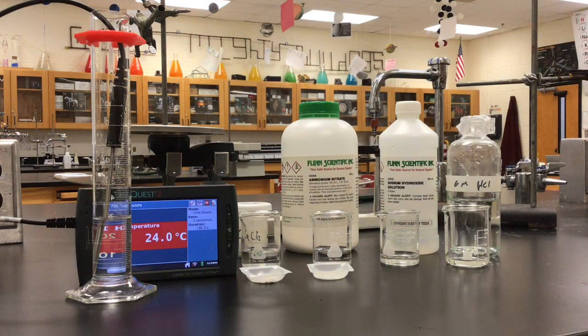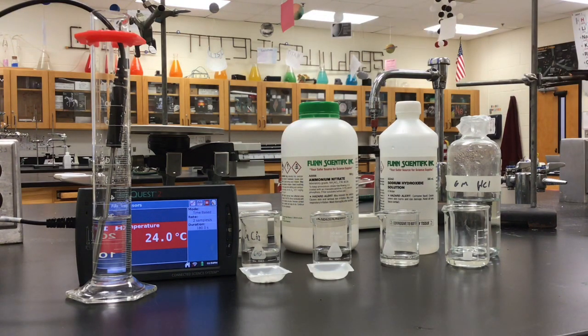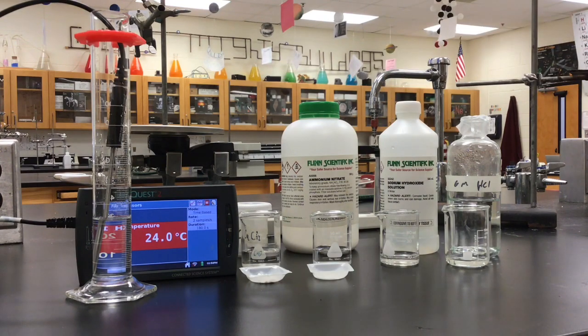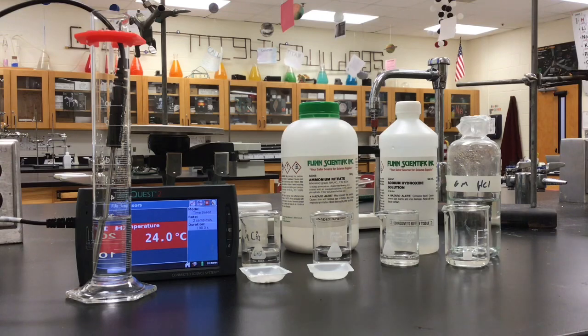Before we begin here, make sure you write down 24 degrees Celsius as the beginning temperature for each of these surroundings, because it's water, and these are solutions here. So mark down 24 degrees Celsius as our beginning temperature for each of these reactions. And then all you need to do is mark down the final temperature.